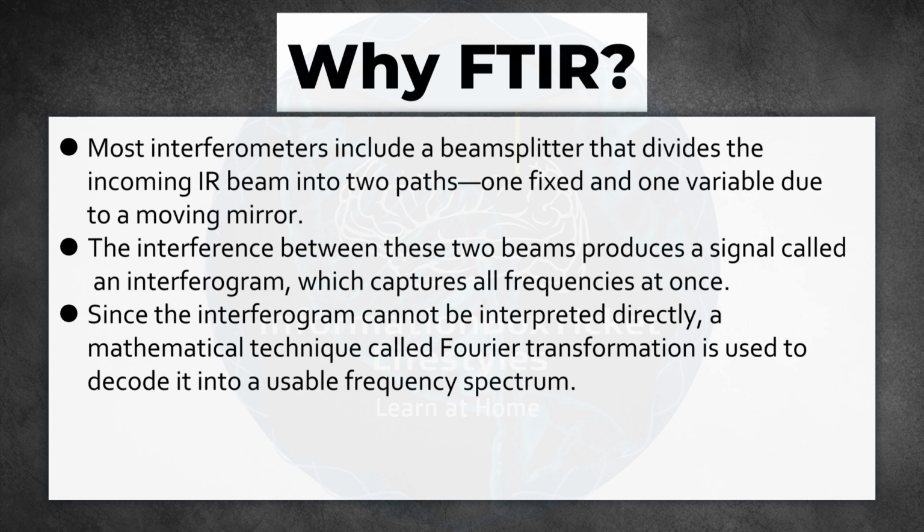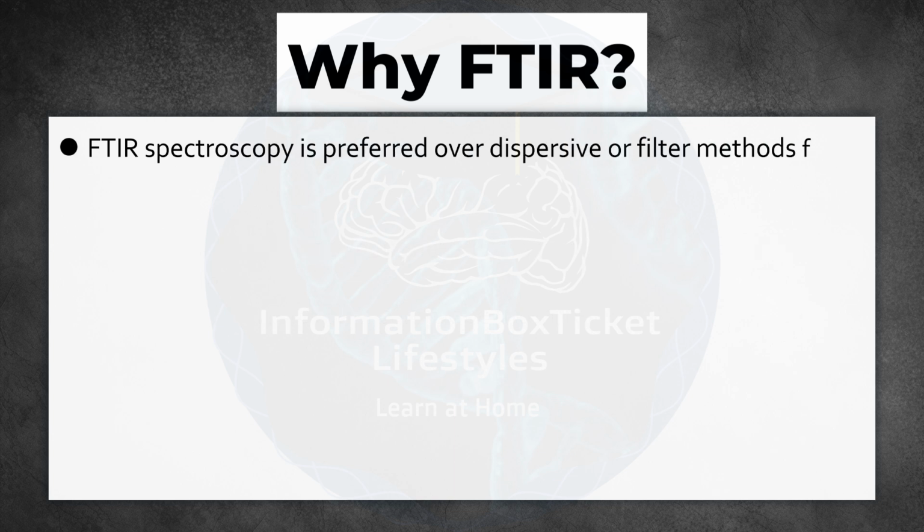The interference between these two beams produces a signal called an interferogram, which captures all frequencies at once. Since the interferogram cannot be interpreted directly, a mathematical technique called Fourier transformation is used to decode it into a usable frequency spectrum. FTIR spectroscopy is preferred over dispersive or filter methods for several reasons. It is non-destructive.